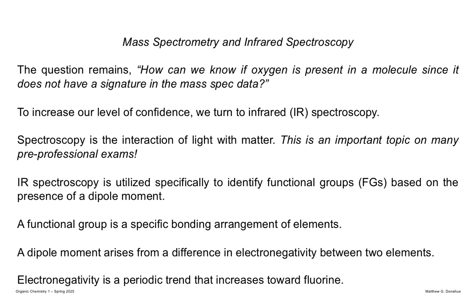In health professions, you're imaging the human body or an animal, and you're getting information from that. So IR is really used to identify functional groups. Remember that a functional group is just a discrete collection of elements with a certain bonding pattern that can exist within the molecule.